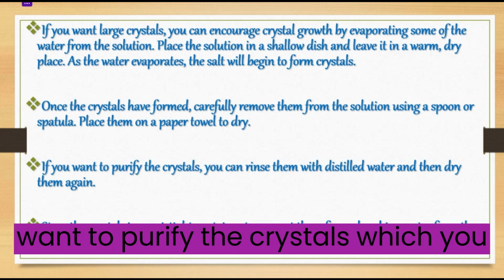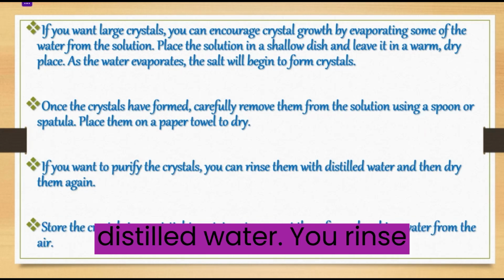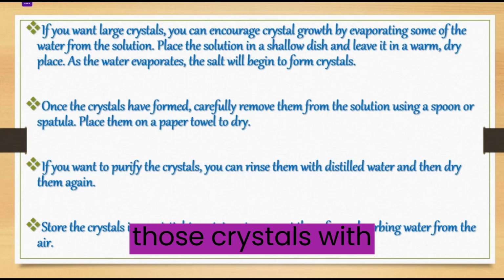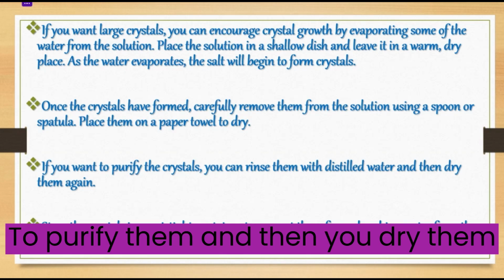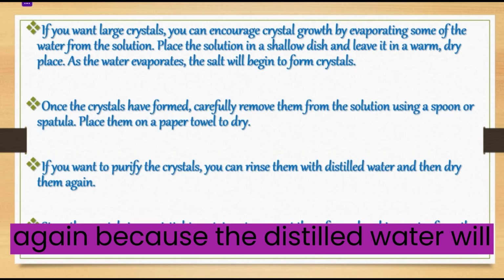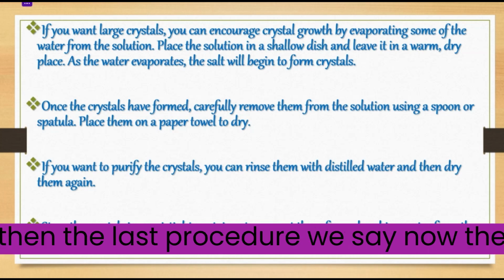Next, if you want to purify the crystals which you formed, you can rinse them with distilled water. You rinse those crystals with distilled water if you want to purify them, and then you dry them again, because the distilled water will remove the impurities.